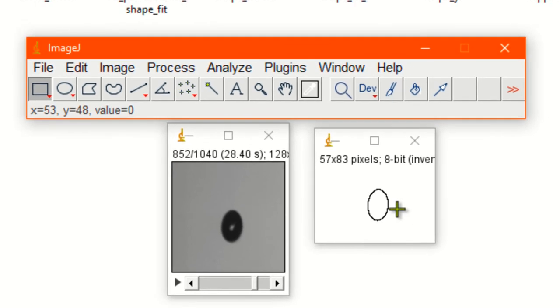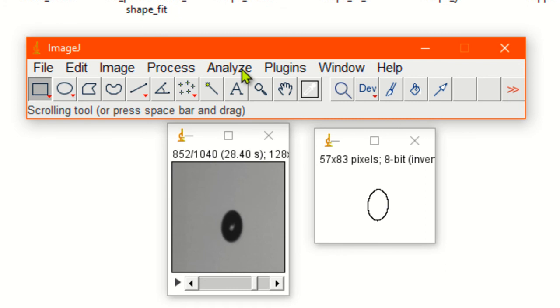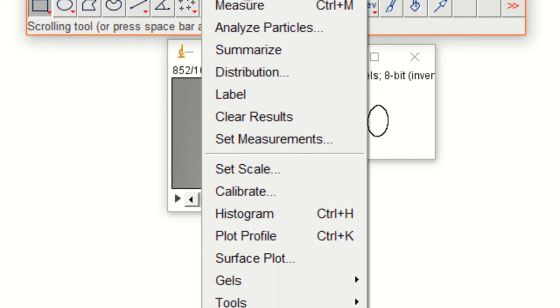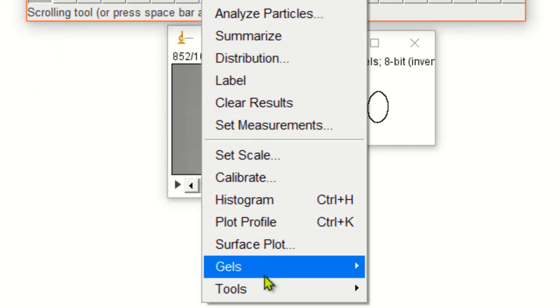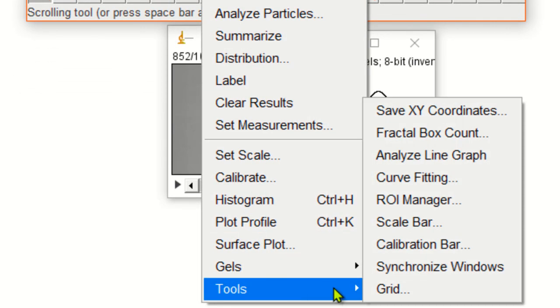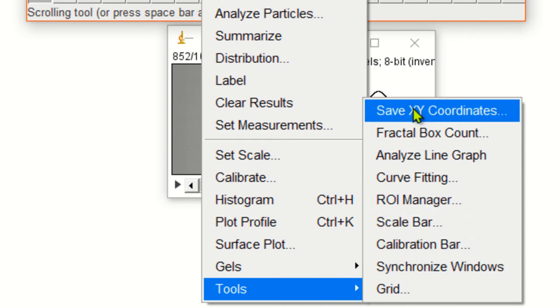Now you got the outline. But you're interested in finding out the coordinates of the shape. To obtain the coordinates, go to analyze, and from the drop-down menu go to tools, and from the drop-down menu go to save XY coordinates.